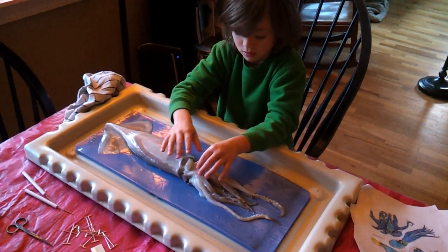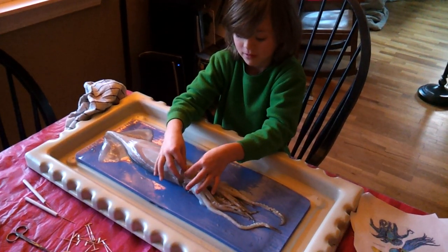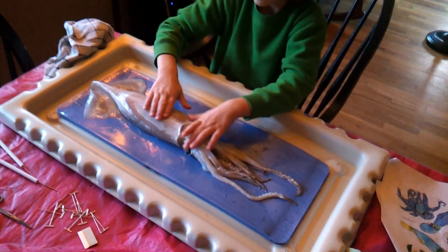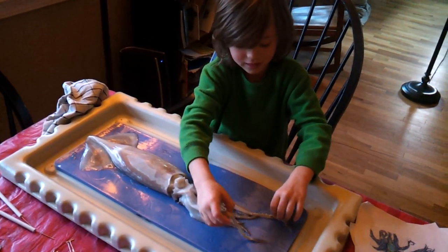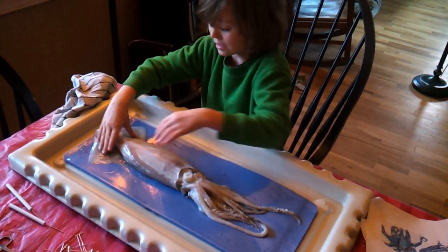Hey Rowan, what are we doing today? We're dissecting a squid. So how do you know this is a squid? By looking at the mantle and the fins.